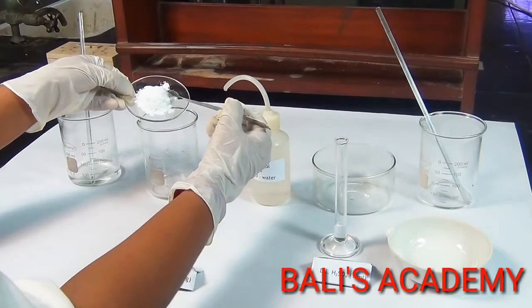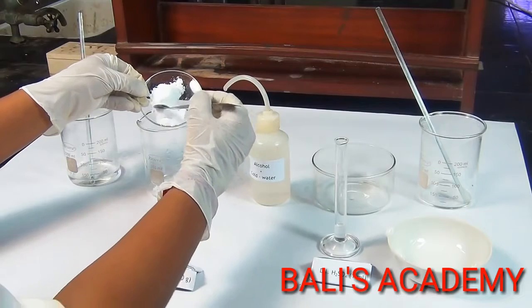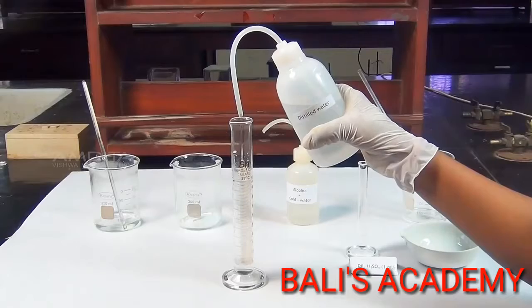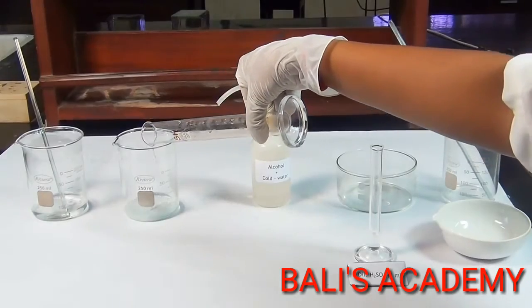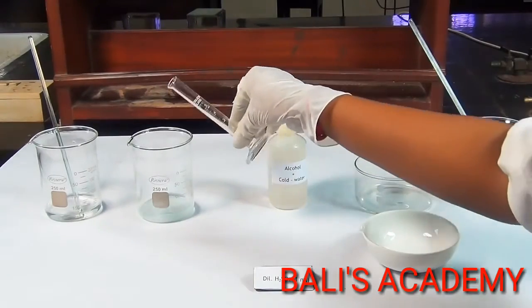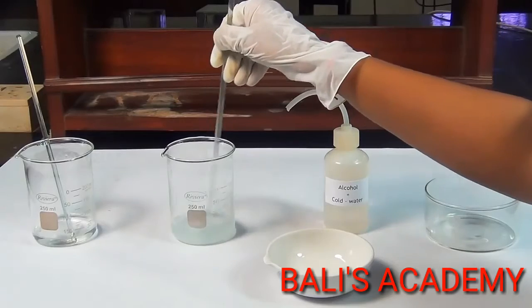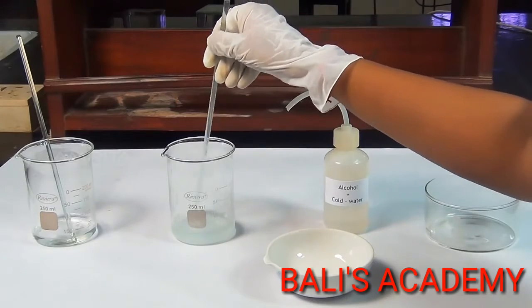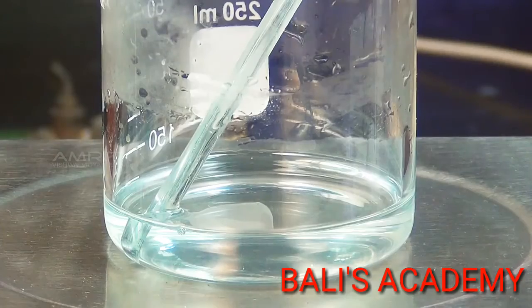Now take 10g of aluminium sulphate crystals in another 250ml beaker. Pour another 20ml of distilled water into this beaker. To this, add about 1ml of dilute sulphuric acid to prevent the hydrolysis of aluminium sulphate. Warm the beaker for about 5 minutes to obtain a clear solution.